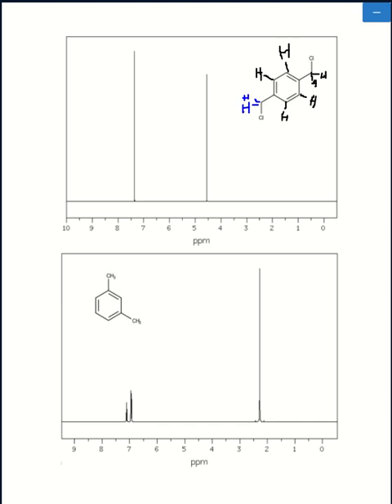And then as for these carbons that I'll draw in orange, they actually have no hydrogen attached. Therefore, the hydrogen for those carbons are not going to show up because there are none.